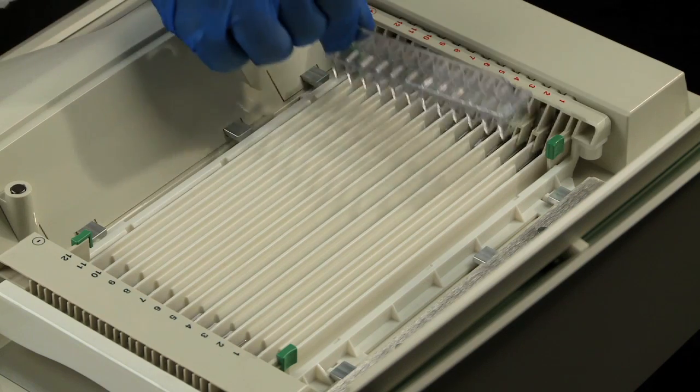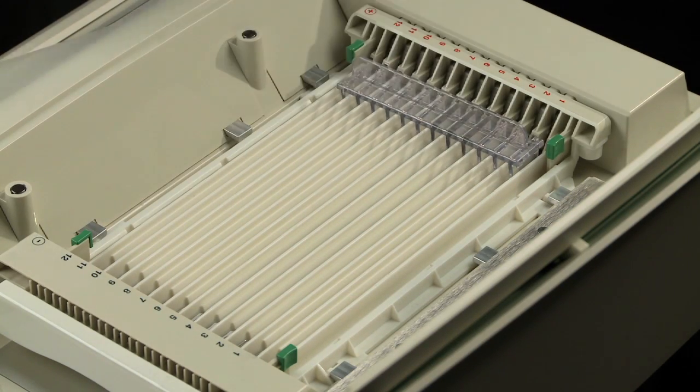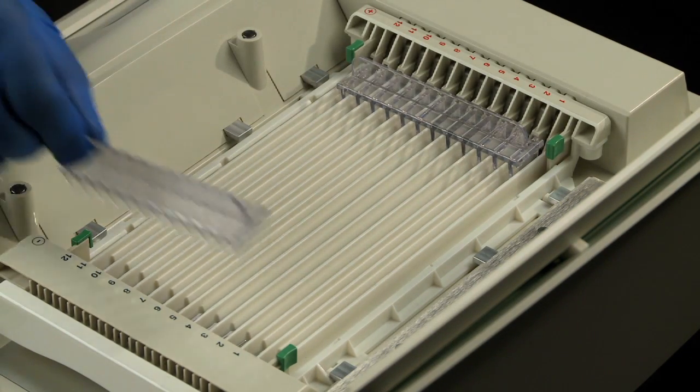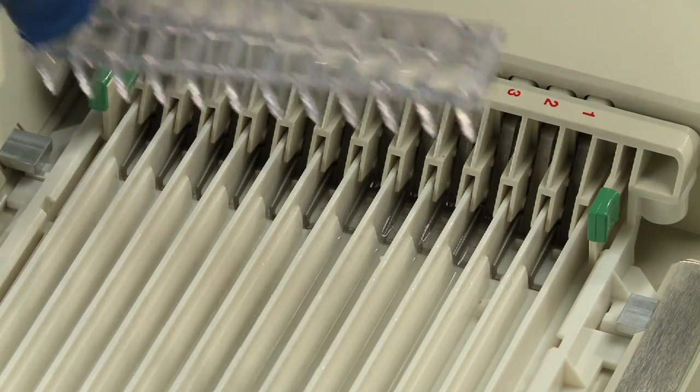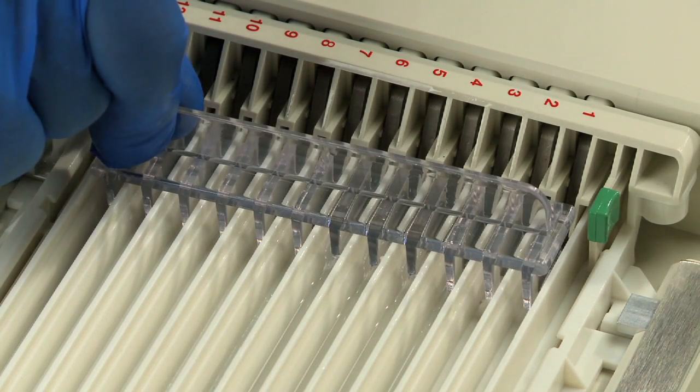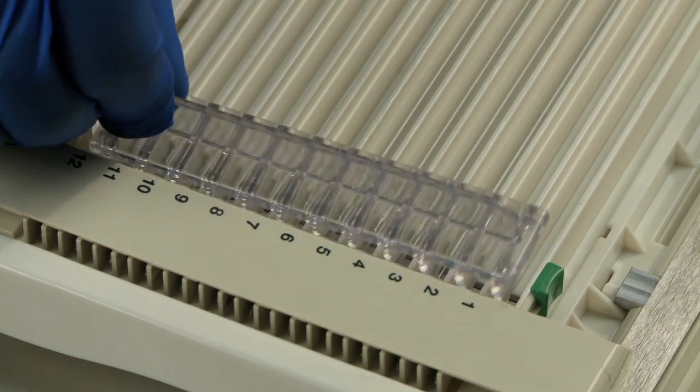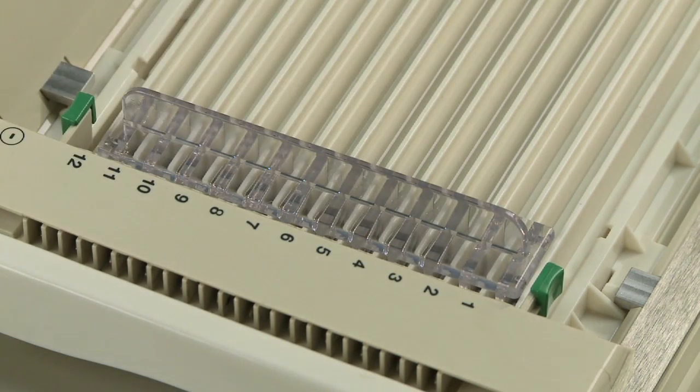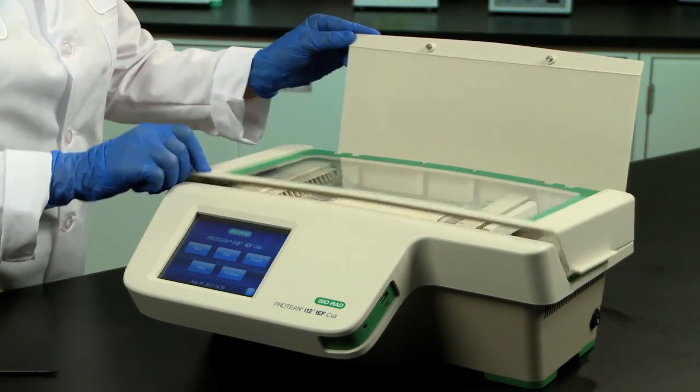Put the IPG strip retainers into place. Without IPG retainers in place, gases formed during electrolysis may lift IPG strips off the electrodes, interrupting electrical contact. Close the lid and you are now ready to program the cell.